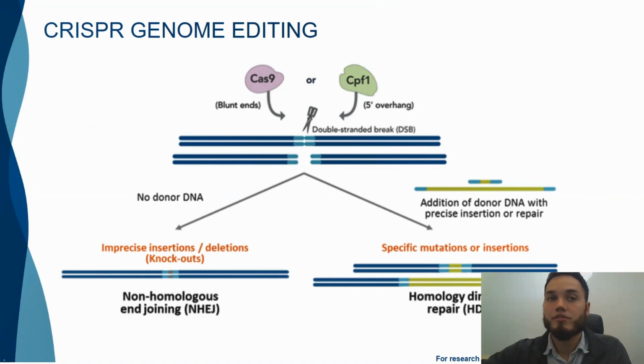So as a quick review, the main enzymes in the genome editing toolkit that we provide and that are often used to edit mammalian cells are usually Cas9 and Cas12a. These two enzymes have distinct mechanisms, structural requirements, and different levels of specificity. But using either enzyme, a double-strand break is generated at a targeted location in the genome, which the cell now needs to repair. This is done using the cell's endogenous DNA repair pathways. And the specific preferential outcomes here can really vary from cell type to cell type.